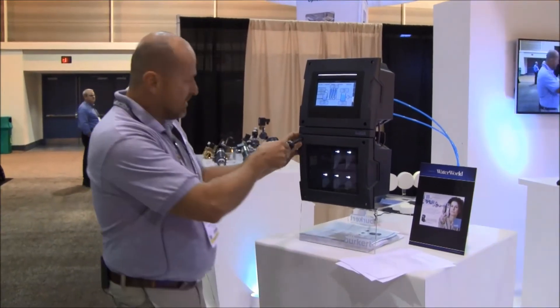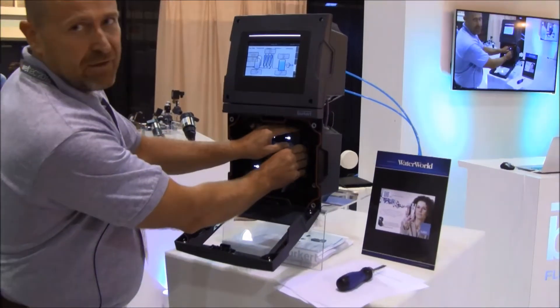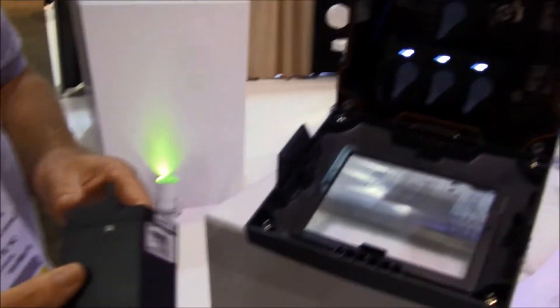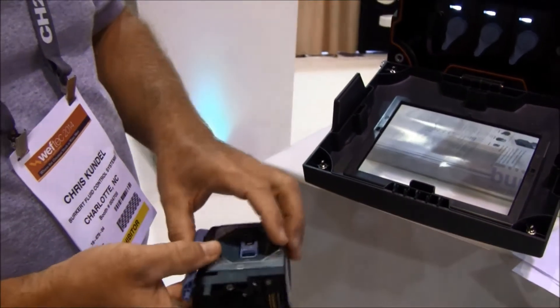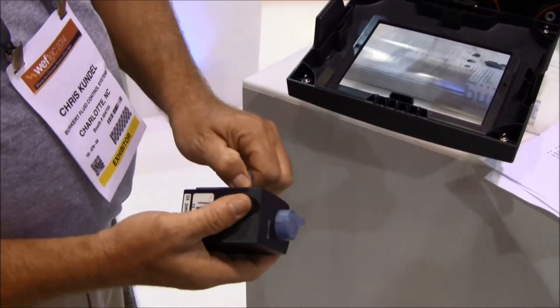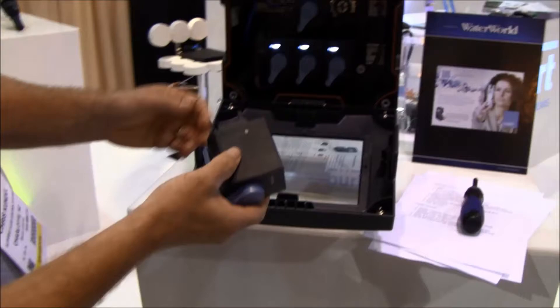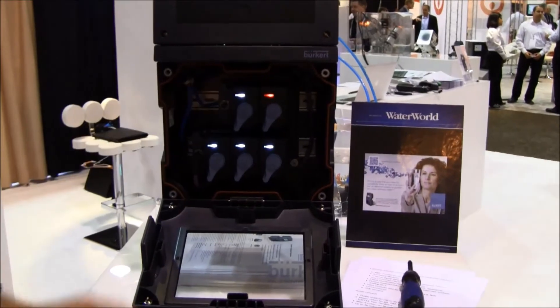It's quite easy to open the box and take out the modules — the different kinds of sensors. In this case I have a pH sensor in my hand. You can also replace the reference system by unlocking a mechanical lock, taking it out, replacing it, putting it back. And we are good to go again.